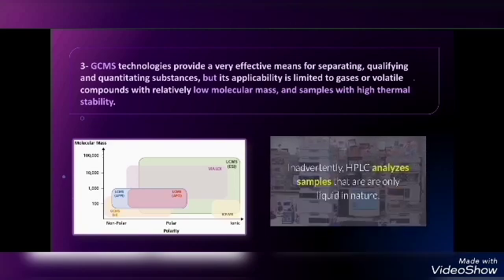Inadvertently, HPLC analyzes samples that are only liquid in nature.